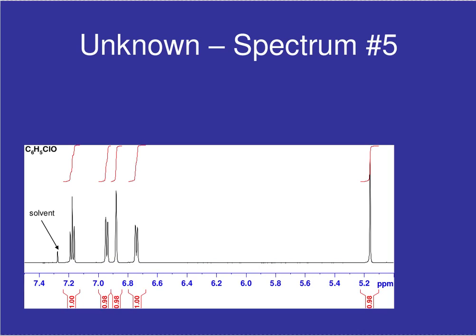Please note that the spectrum was run in chloroform, in deuterated chloroform, and there is some normal chloroform present, and that comes from the solvent. So that signal there is from the solvent, so don't worry about that.